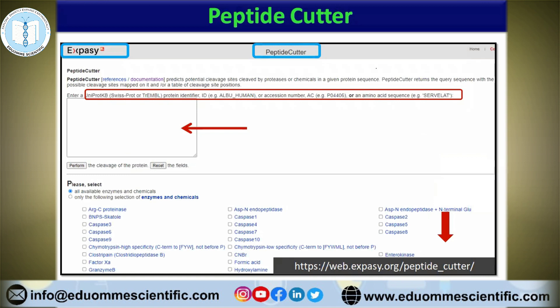Peptide Cutter will look like this. As we have shown in our last videos, here also we can provide our input sequence. Either we can paste our sequence or we may provide the ID. You may either provide the SwissProt, TrEMBL, or UniProt ID, or you may paste your sequence directly.